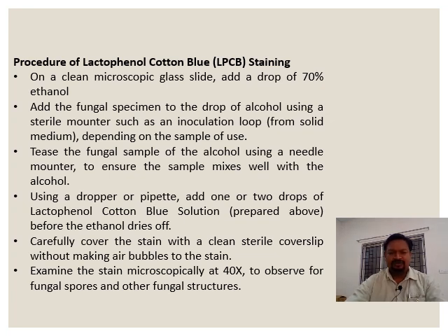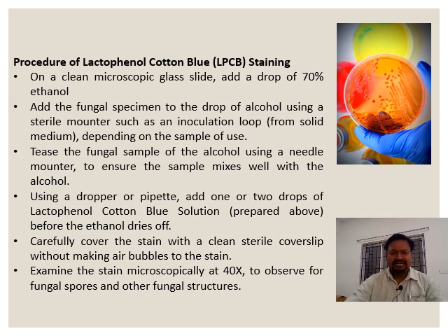Before the ethanol dries off, carefully cover the stain with a clear sterile cover slip without making air bubbles in the stain. Examine the stain microscopically at 40x to observe fungal spores and other fungal structures. The procedure for lactophenol cotton blue staining: on the clean microscopic slide, drop 70% ethanol.